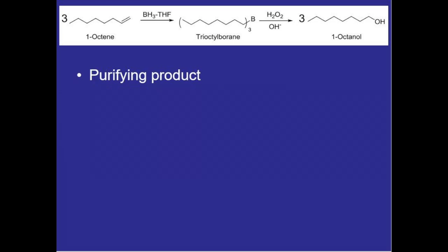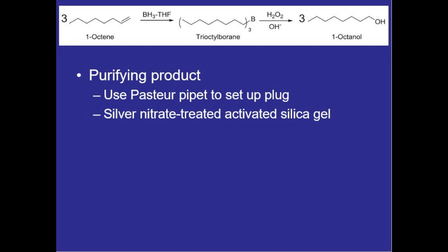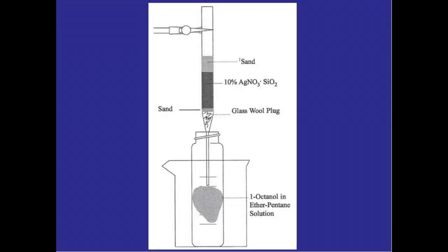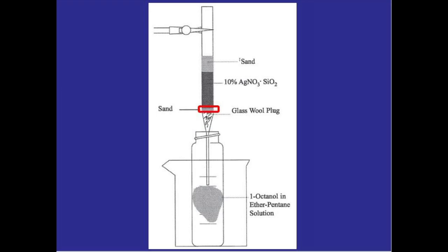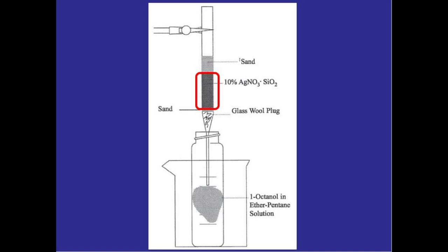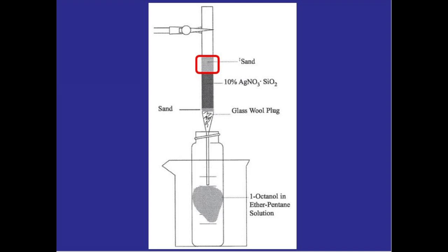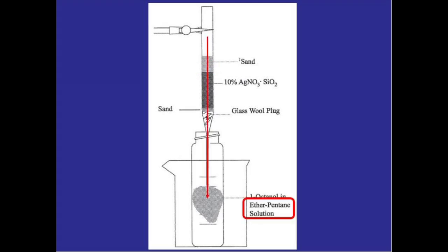To purify our product and to separate it from any leftover octene we are going to set up a plug which is similar to a chromatography column in the sense that we're going to manipulate something like polarity or in this case Lewis acid Lewis base properties to separate our product from any contamination. And for this plug we're going to use silver nitrate treated activated silica gel. Wow that's a mouthful. So this is what the plug will look like. We'll plug our Pasteur pipette using some cotton then add a small layer of Ottawa sand and add our silver nitrate treated silica gel after which we'll add another little layer of sand. After this we can go ahead and add our product on top and we'll elute that through the plug using an ether pentane solution.